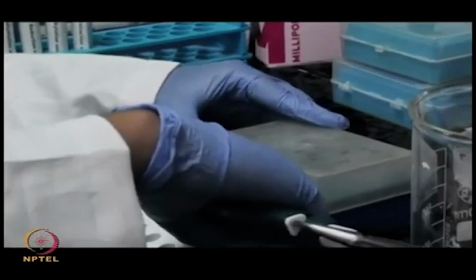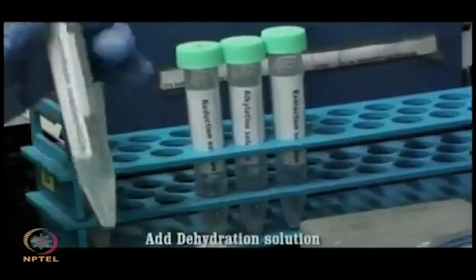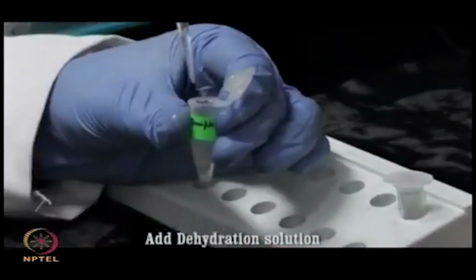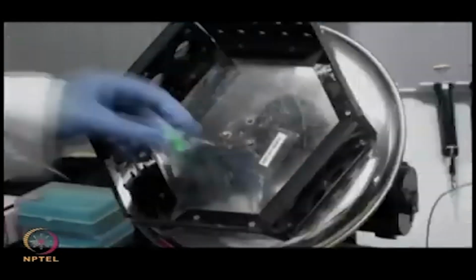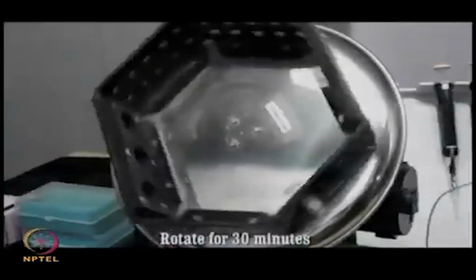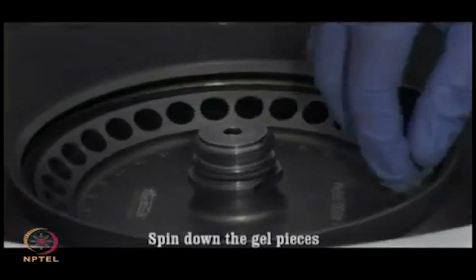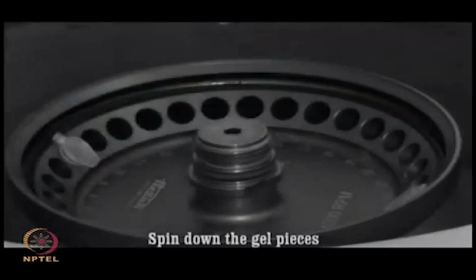So, you have seen the animation. Now, once the staining is removed, you can add dehydration solution. Add 50 to 100 microliter of dehydration solution and rotate that at room temperature. You need to ensure that you change the solutions after every 10 minutes, so that gel pieces become white and stick together. Now, spin the gel pieces down at 1000 g for 30 seconds.